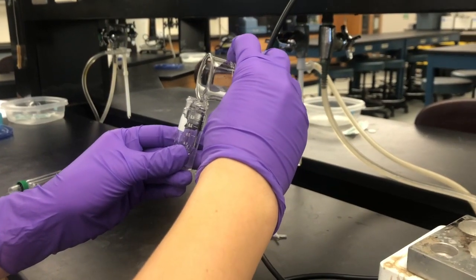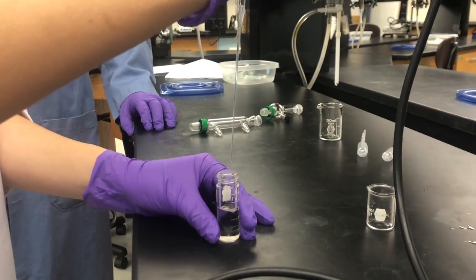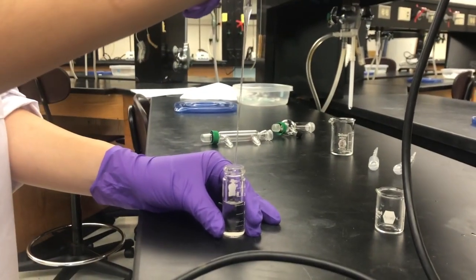Pour the 3 mL of 2-methylcyclohexanol into a conical vial. Add the phosphoric acid dropwise using a pipette.